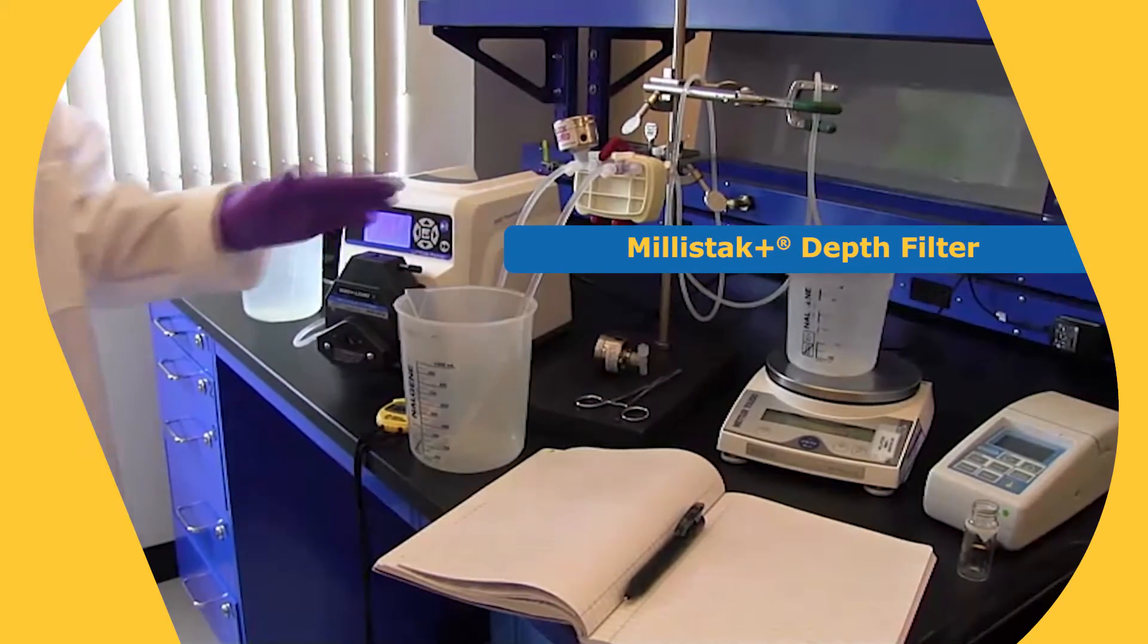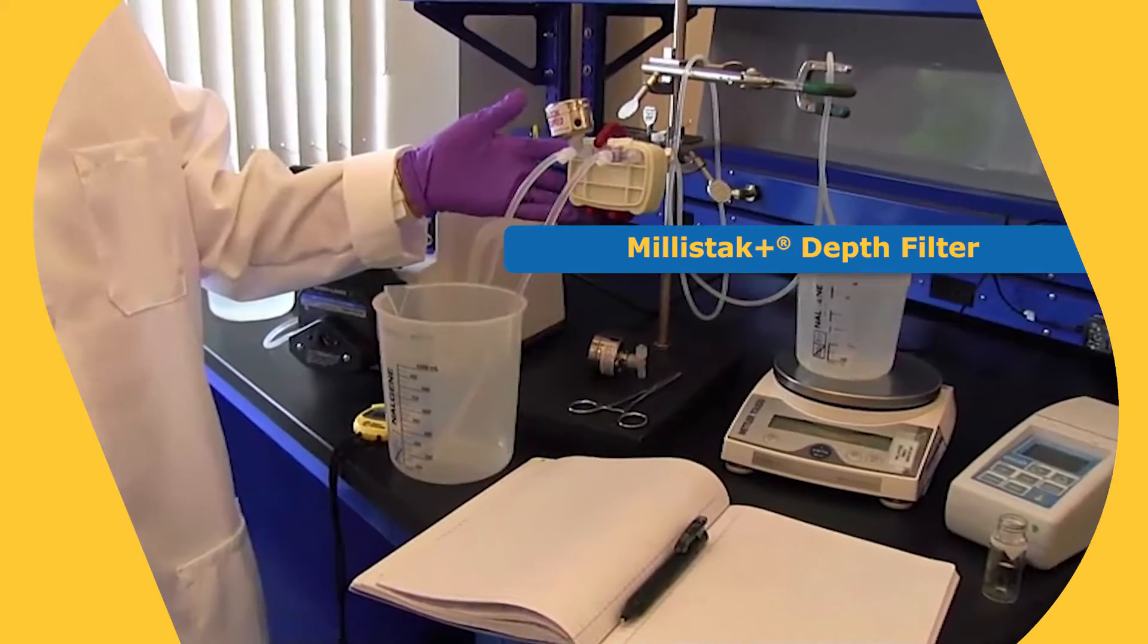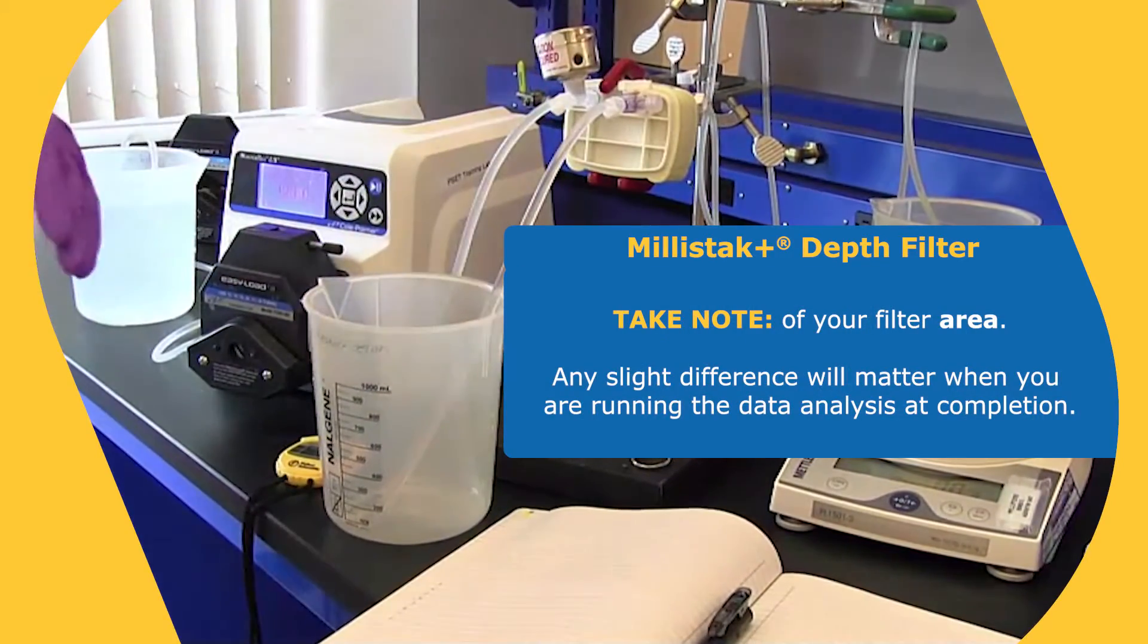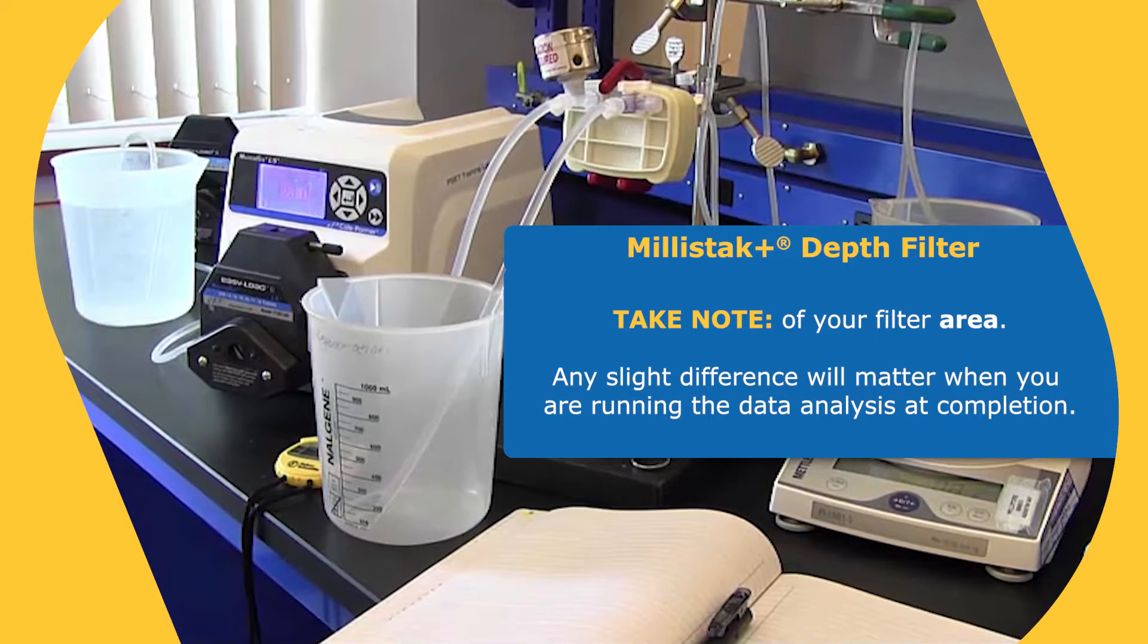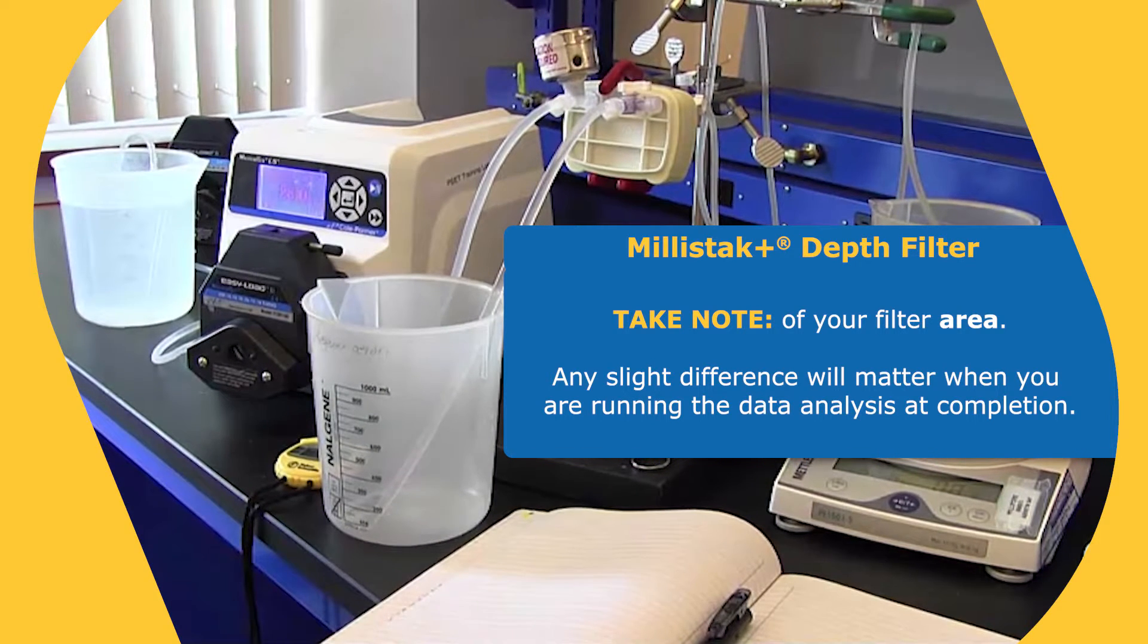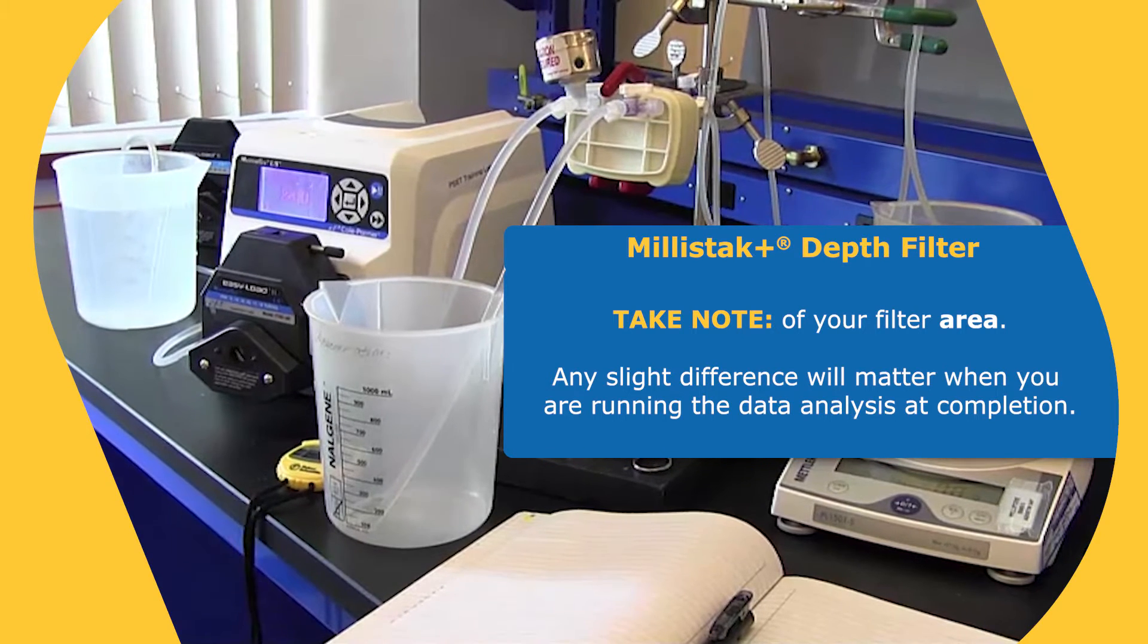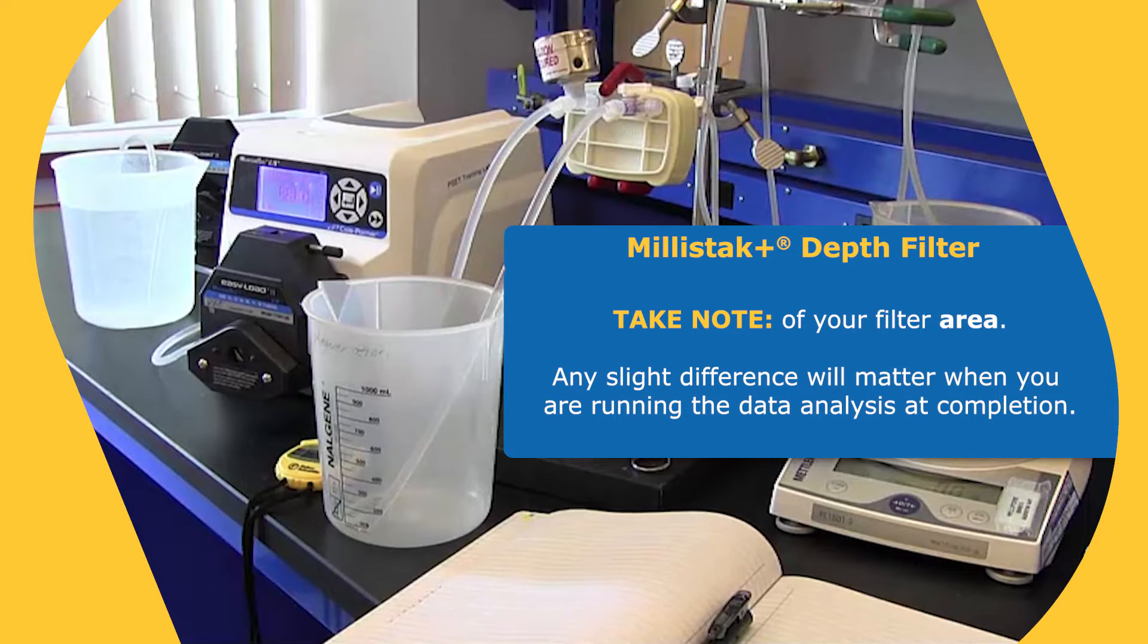We have the Millistack Plus depth filter here. This depth filter is our small scale, and it's 23 square centimeters. I'd just like to point out that as you're running your experiments, I would take note of what the area is in case you are testing a different filter that might have an area of 25 square centimeters or 26 square centimeters. The slight difference there will actually matter when you're doing the data analysis at the end.